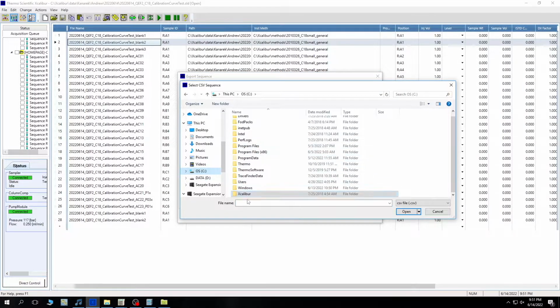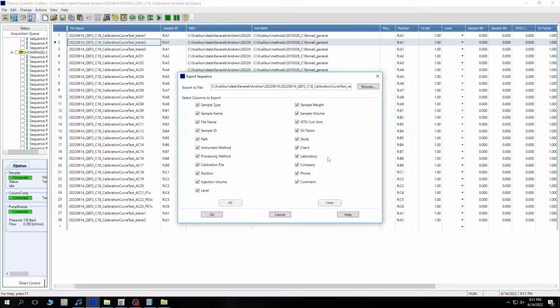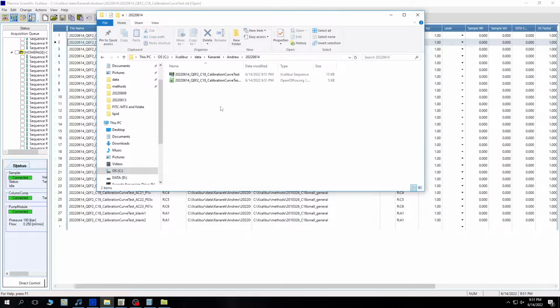And now we're going to export our sequence into the same folder, and we're going to call it _rand at the end, and you copy and paste the first part again from the cell which we got it from. Just for simplicity's sake, it's easier to do that.